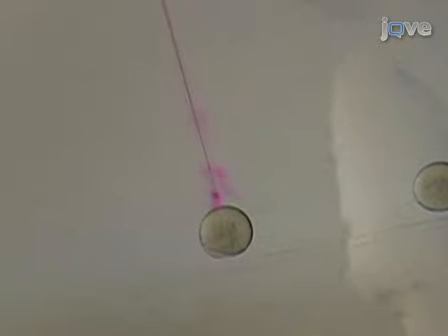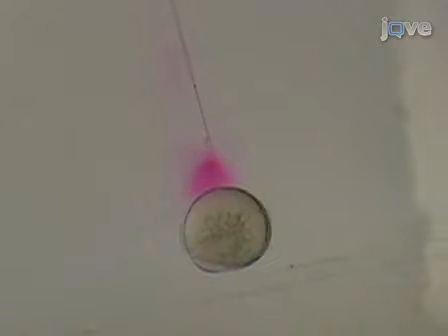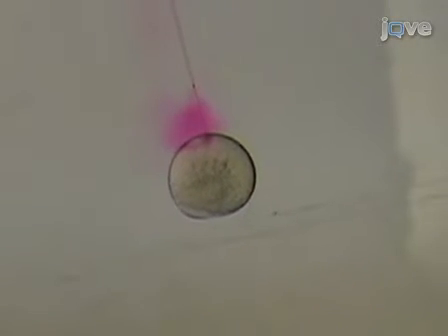Inject 1 nanoliter of 1 to 3% solution of fluorescent dextran directly into the yolk of dechorionated embryos between the 1 and 4 cell stages. What I'm going to do is position the embryo right under the needle. I'm going to jab the needle gently into the center of the yolk and depress the foot pedal once.